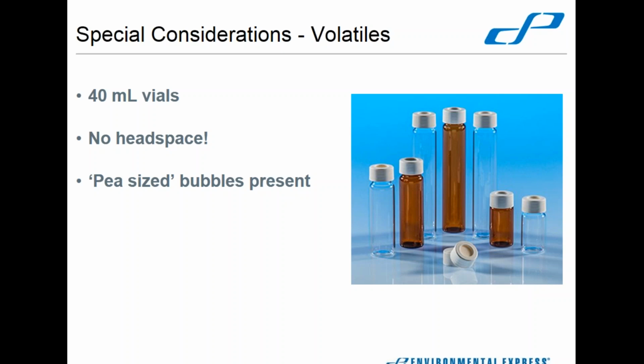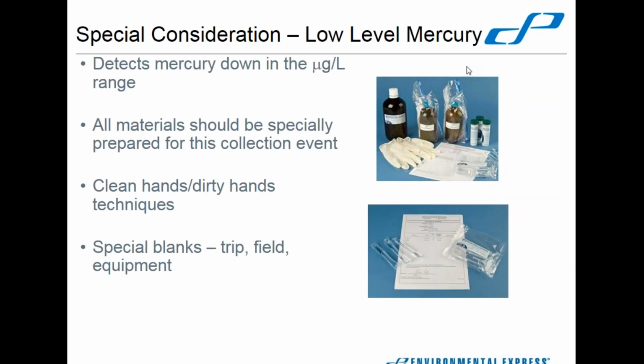If you were to fill the vial first and then add preservative on top, you may not have enough preservative actually make it down all the way into the sample itself to do that particular preservation.